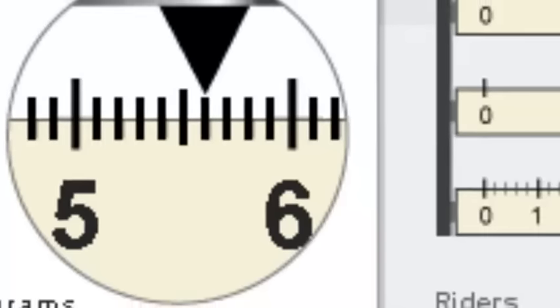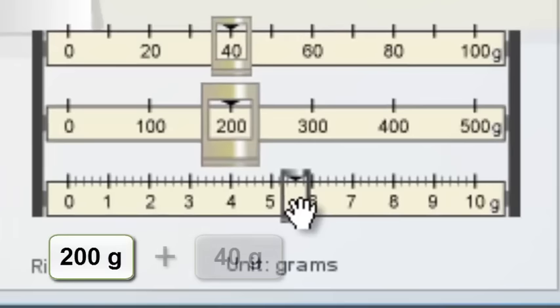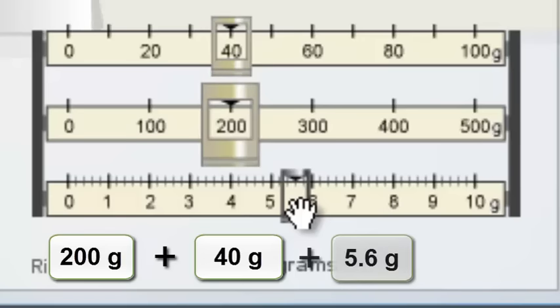Now all you have to do next is add them up. You take the 200 grams and you add the 40 grams that you position the riders at. So that gives you a total of 240, and then you take a look at the ones gram that you moved, which is 5.6. All you do is then add 240 plus 5.6, and that'll give you a total mass of 245.6 grams, and that's how much mass this light bulb has.